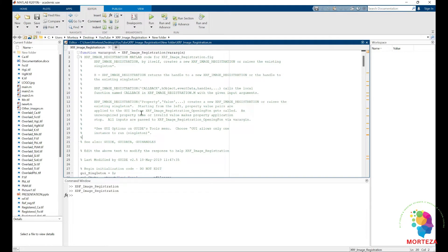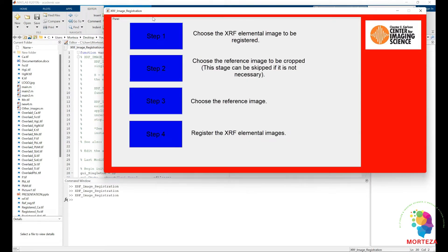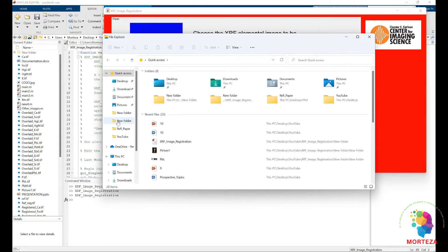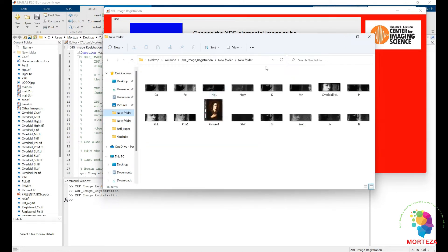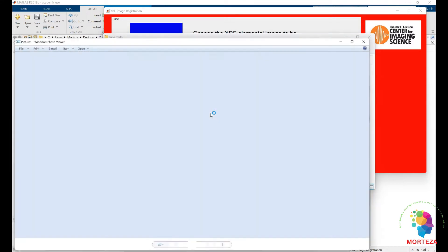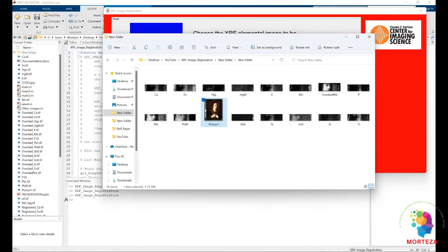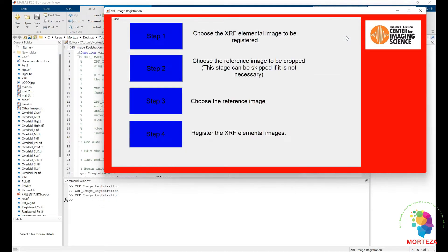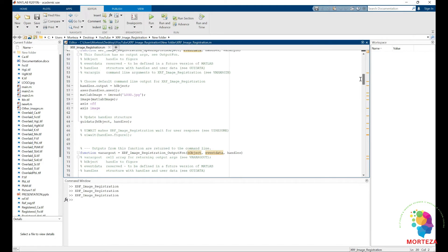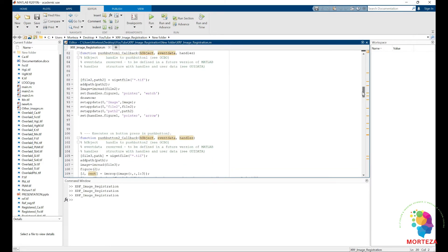Here is the GUI that I have written for XRF image registration in MATLAB. Let's run it and see the steps. There are four steps: the first is to choose the XRF elemental image; then choose the reference to be cropped — which is necessary in our case because the reference is much bigger than the XRF images; the third step is to choose the reference image; and the fourth step is to register the XRF elemental image.